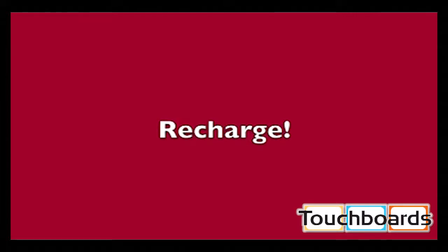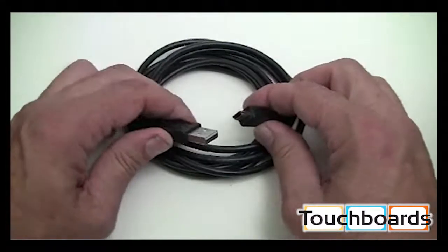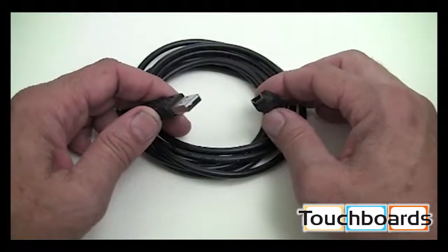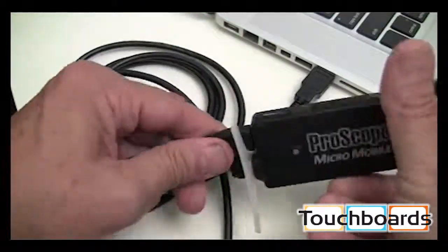If you've been using your ProScope MicroMobile with the LEDs for at least five hours, you'll see the power indicator change from green to yellow and then red. It's time to charge it up by using the included Mini to USB charging cable. Just plug it into a USB port on your computer or plug the USB into a USB to AC adapter.